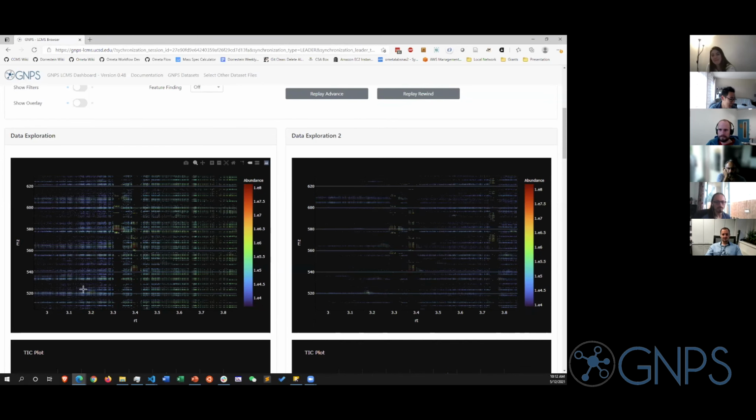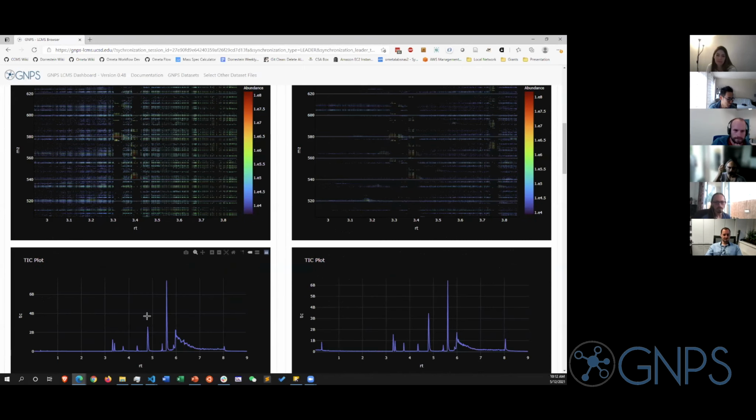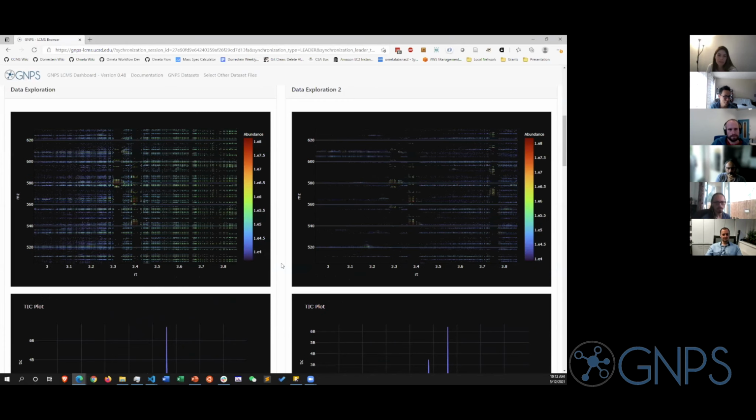Again, about the heat map itself, what we've shown here is, I think a lot of people traditionally probably look at TICs and look at it that way. The influence of this comes from proteomics. My background historically was proteomics, and this is how I always viewed the data when I was a PhD student. On the x-axis is the retention time, the y-axis is the m/z, and the color that you impart on the heat map is the intensity of the MS1 information.